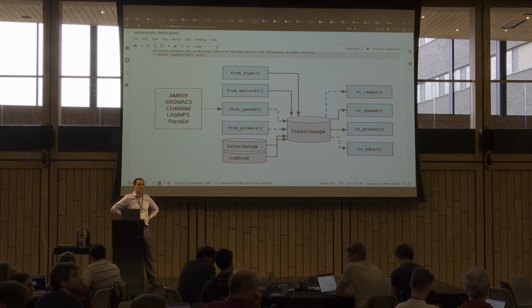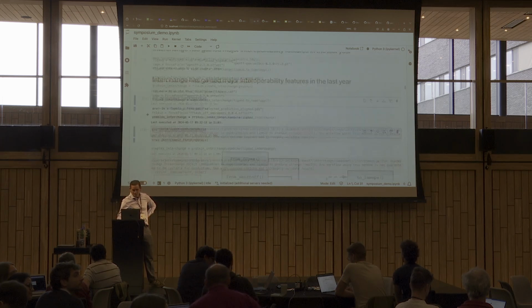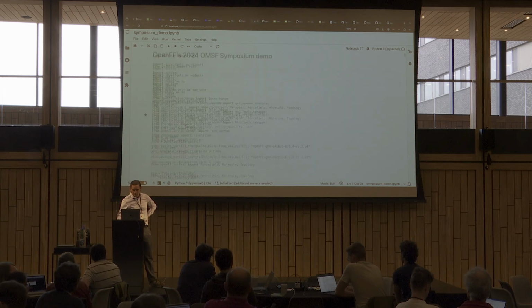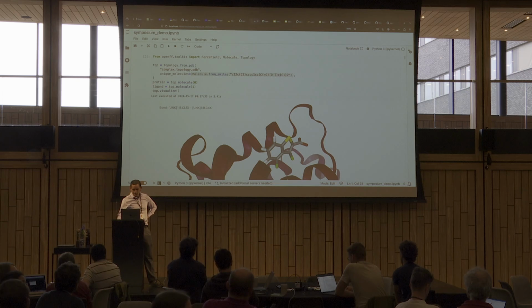Thanks. Question at the very beginning when you read in this PDB. So I assume as it comes from OpenFold, it has hydrogen coordinates. But where do I worry about the protonation state, tautomeric state of the histidines?